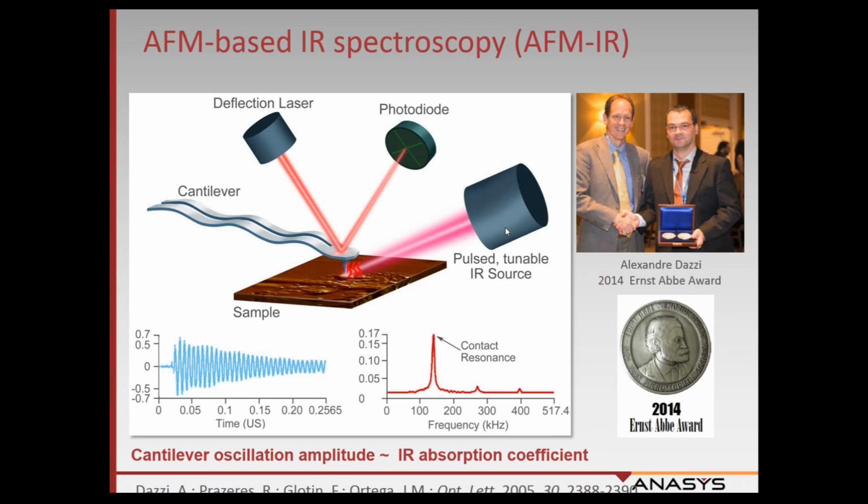So now we're going to describe a little bit the AFM-based IR spectroscopy, AFM-IR, for those of you who have not heard about this technique before. This technique was developed by a gentleman named Alexander Dazzi a number of years ago now. In 2014, he was awarded the Ernst Abbe Award for the invention of this technique.